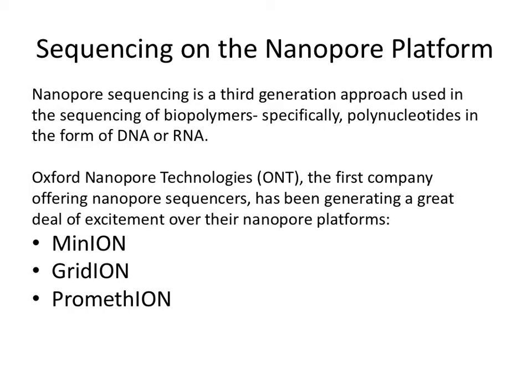So I'm going to cover Oxford Nanopore. It's not the only single molecule platform, as Mark also alluded. PacBio is a huge machine. You have to invest a lot to get a PacBio machine. It will fill half of this room. The computation for it is too. And it costs quite a lot. Even the smaller PacBio is a huge machine and costs quite a lot.